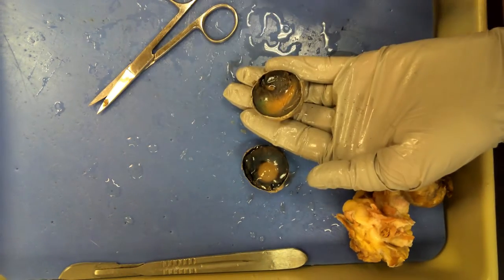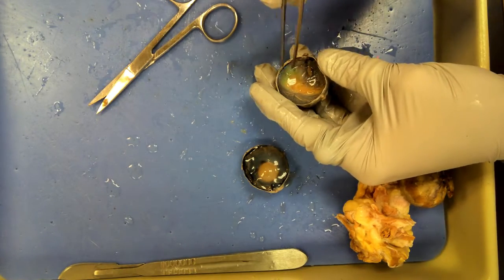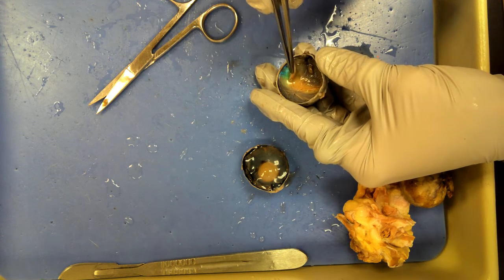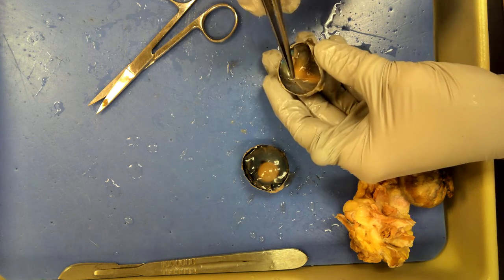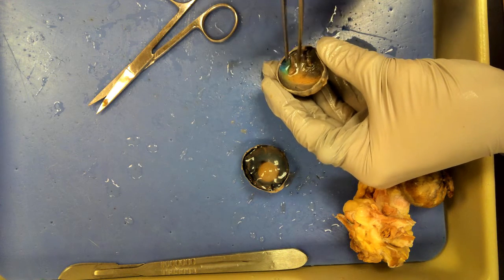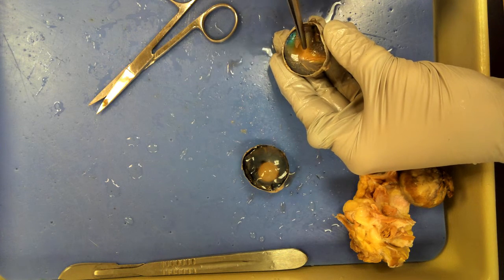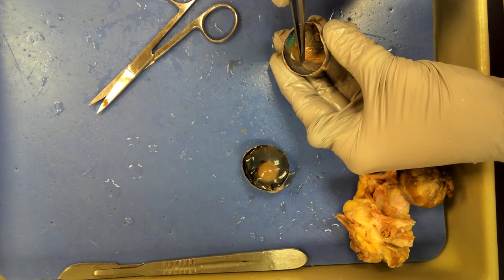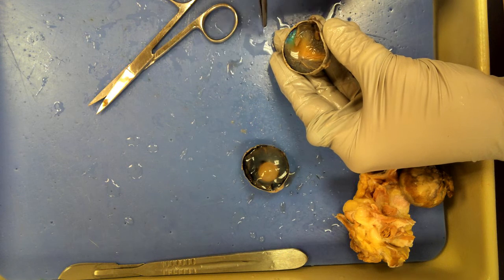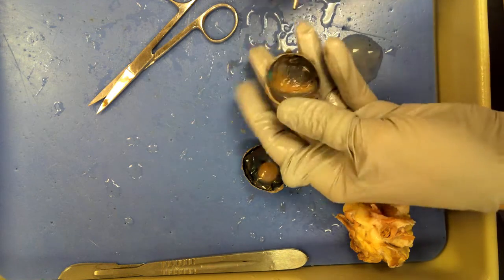This is the posterior vitreous chamber. The sensory layer is the retina. If you see that beige covering — see how blue that is, and then the yuck color on it — that yuck color is the retina. If you look carefully you can see all these foldings, and they all bunch together right there. That is the optic disc, which is the blind spot, and it leads to the optic nerve.